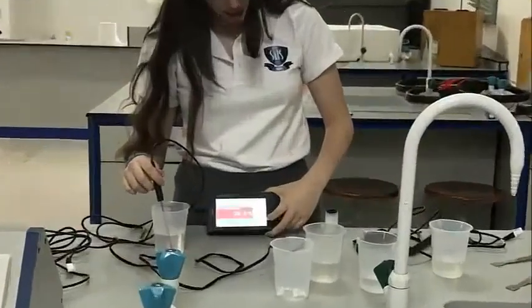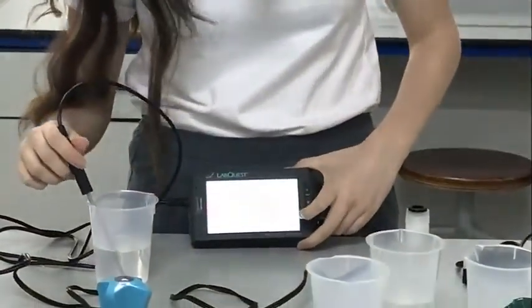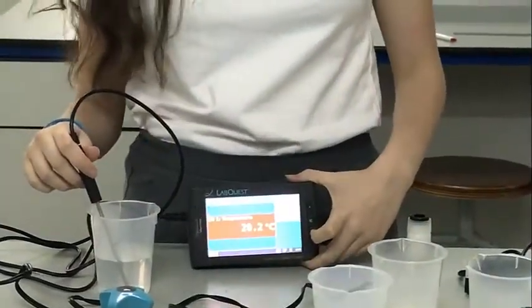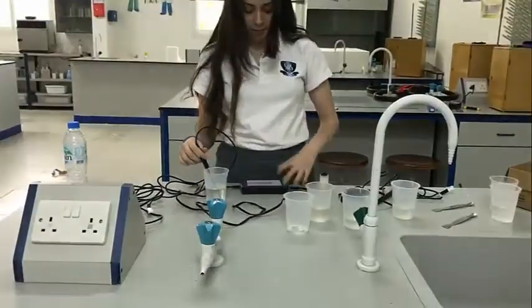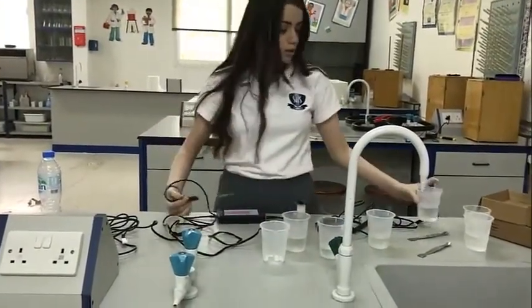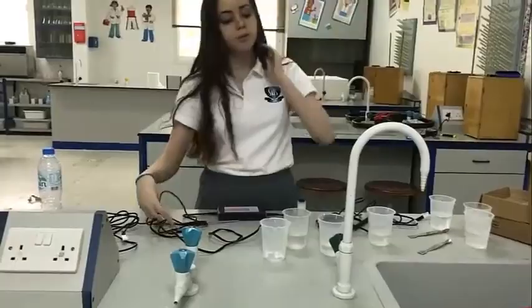The temperature is decreasing. It stopped at 20.2 Celsius degrees. So we still don't know if it's an endothermic or exothermic, because we still didn't check the temperature for the other substance.